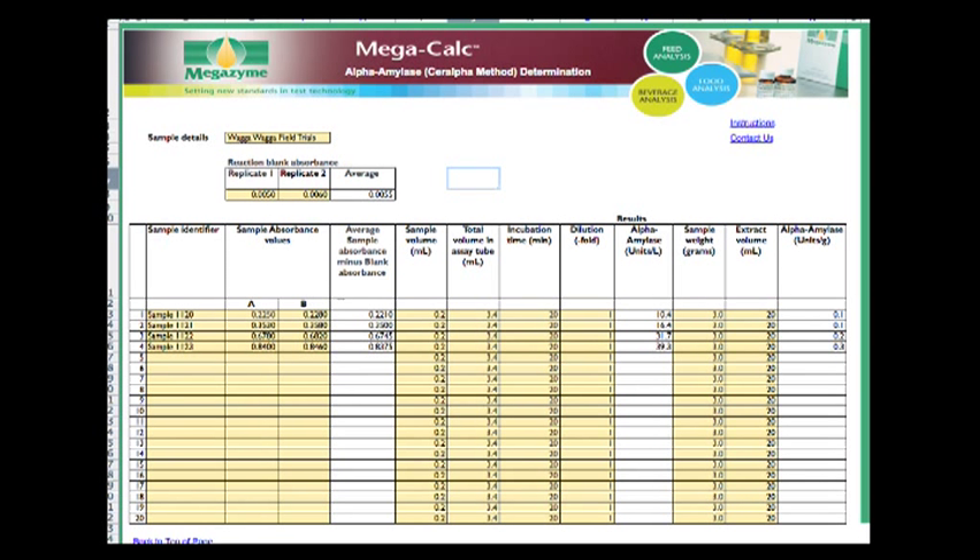The use of the MegaCalc calculator for measurement of alpha-amylase in wheat samples is shown in this slide. First the sample details are entered, then the blank absorbance values are entered into the top table, followed by details of each individual sample and the absorbance values in duplicate. The calculator automatically determines the average. Sample volume is left at 0.2ml unless changed. The total volume in the assay cell is 3.4ml and incubation time is 20 minutes. The calculator then calculates alpha-amylase activities in units per gram of sample, given that sample weight for wheat is 3g and extraction volume is 20ml.